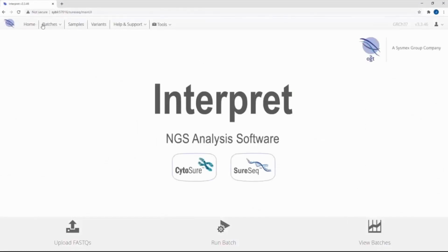Past the login prompt, the user is greeted with this homepage with the different menu bars at the top and the options here to the right, which I'll describe in more detail later on. At the bottom there are the 3 simple steps in the workflow we propose, which is for the user to upload their FASTQs, run a batch of FASTQs with specified parameters, and then once that has completed, the user can view the results of that batch. So we'll run through these options one by one.